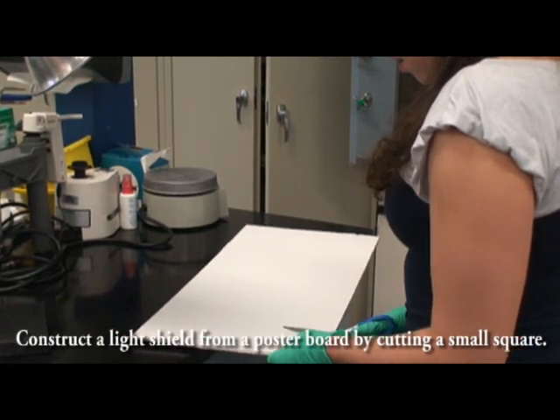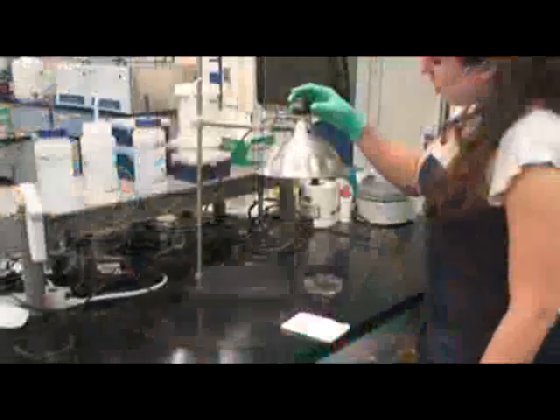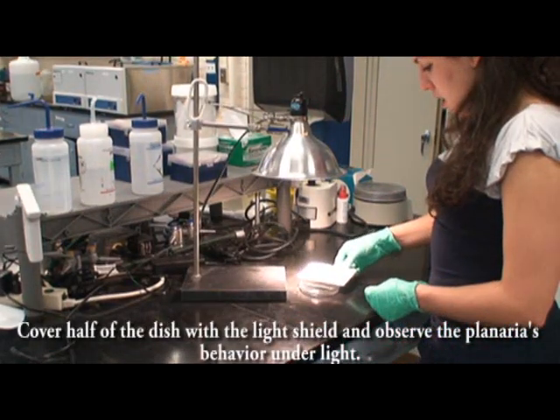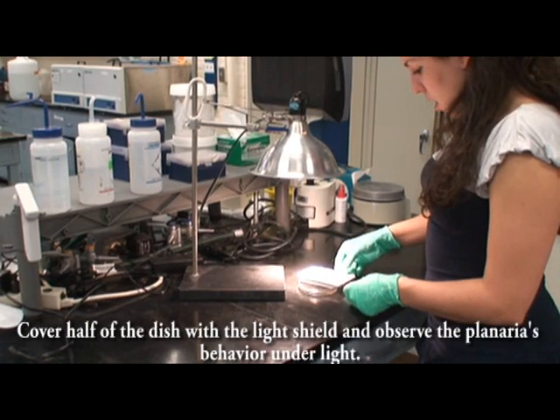Construct a light shield from a poster board by cutting a small square. Cover half of the dish with the light shield and observe the planaria's behavior under light.